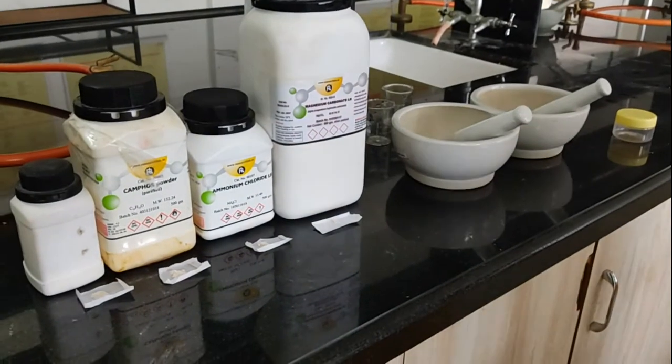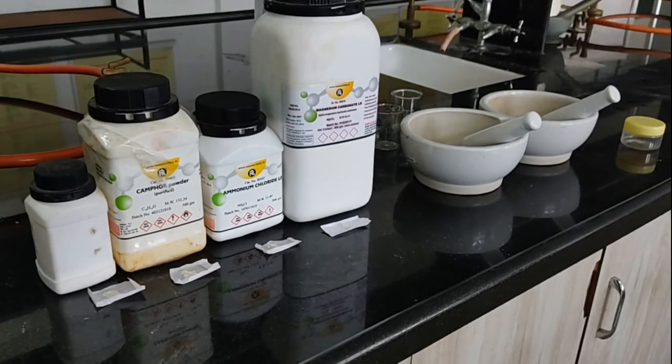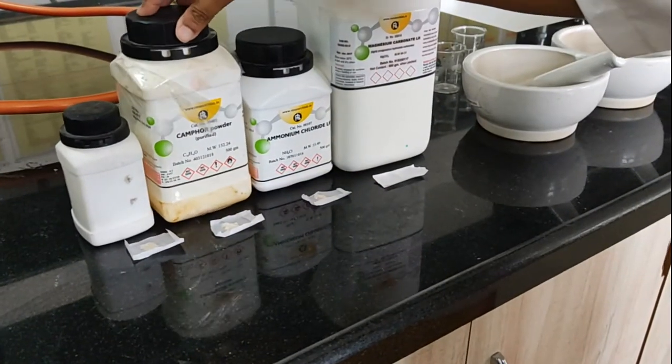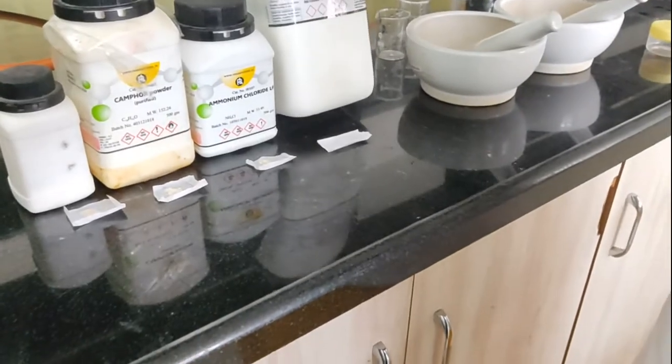So first of all we have these ingredients which are previously weighed. That is, first of all, this is menthol which is previously weighed. Then this is camphor, this is ammonium chloride, and this is the magnesium carbonate.